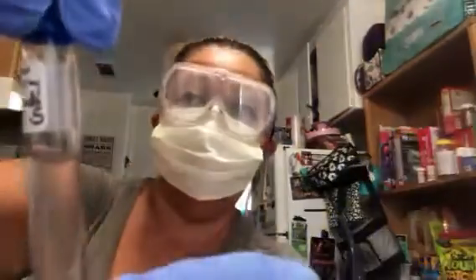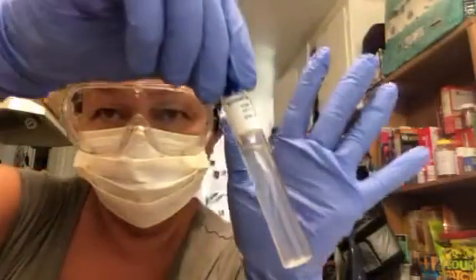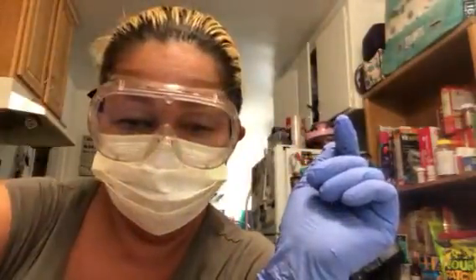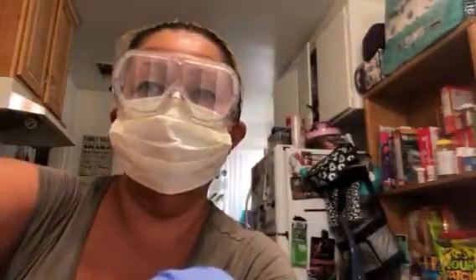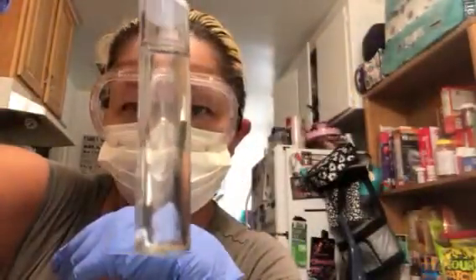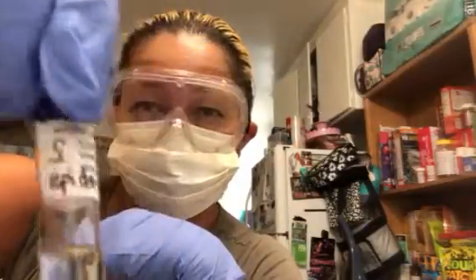And then the NaCl broth at 1% for the S. epidermidis. There is a cloudiness to it. I think you can see that. Try to get some light in there. And then the NaCl at 7%. Rather clear. Almost completely clear, actually. This is S. epidermidis.